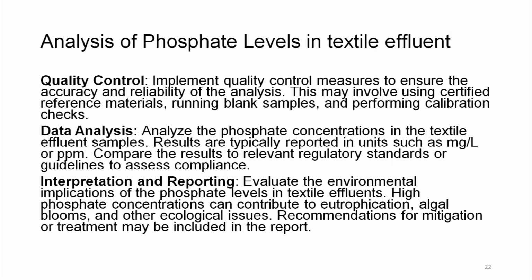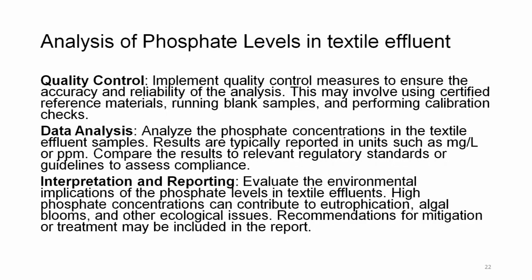Data analysis: analyze the phosphate concentration in the textile effluent samples. Results are typically reported in units such as milligram per liter or ppm. Compare the results to relevant regulatory standards or guidelines to assess compliance.